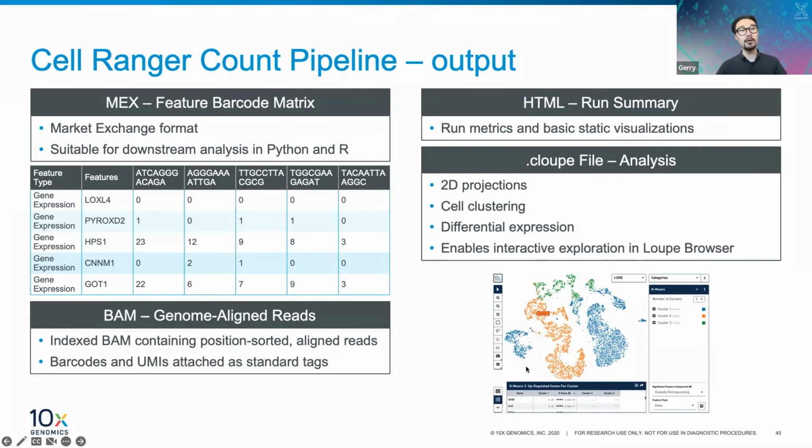So for example, clustering different cells together, looking at differential expression, and also projecting different clusters individually and all together. This is something that I can also do a demo of if you want. But this is further downstream of the wet lab portion.